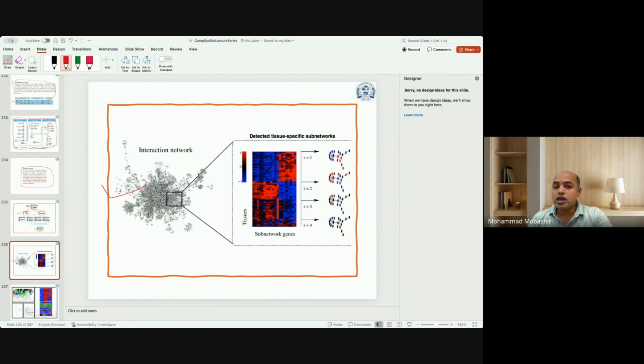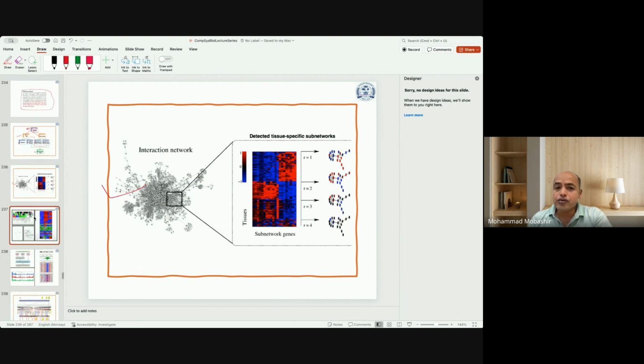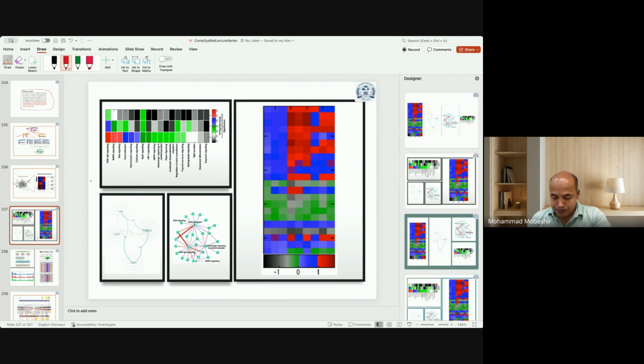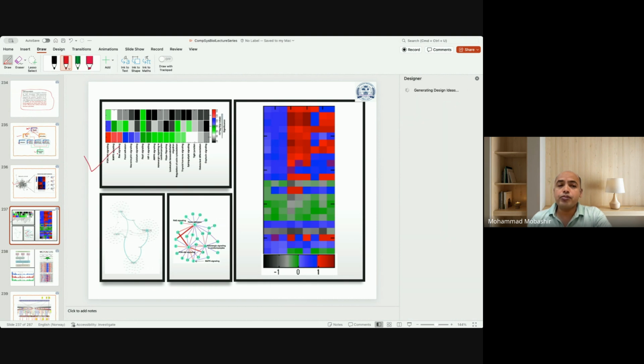There is no complication in the analysis or understanding of such data. Another way of data analysis and presentation for NGS data or high throughput data could be, for example, pathway plotting in different samples or in different conditions. Then this is network level understanding.